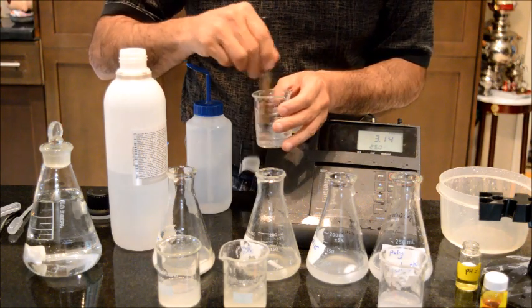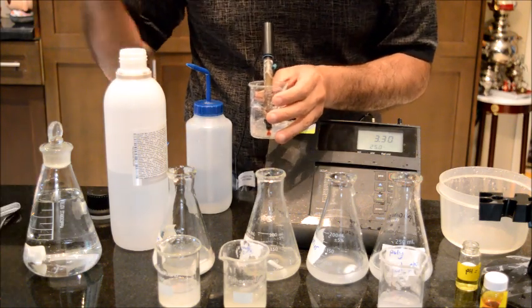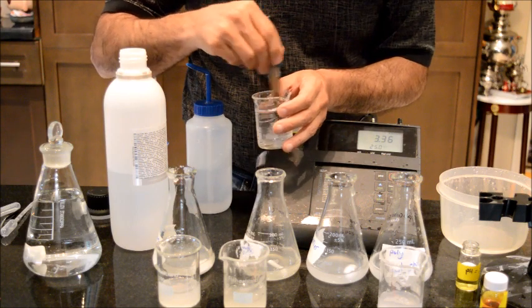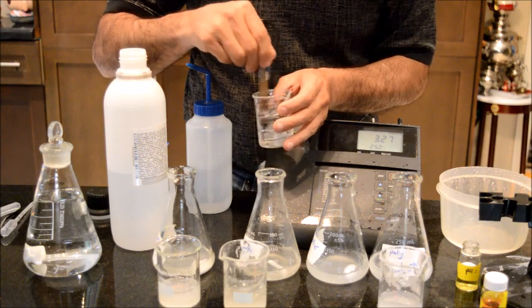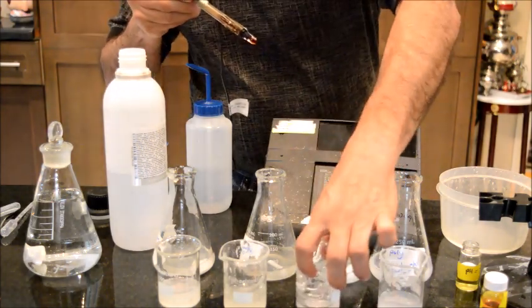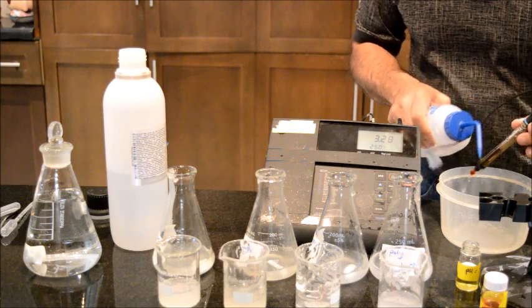Okay, I think I'm almost there. Again, as I said, I don't have the intention to make it exactly the same. I mean, if it's close enough, it's close enough for this video. And because the gel is too thick, it's a little difficult to get it all mixed or get an accurate reading. I think I'll leave it there. But this is just extremely thick. As you can see, it's extremely thick material, and it's not really giving me an accurate pH measurement because the electrode is all covered with gel.